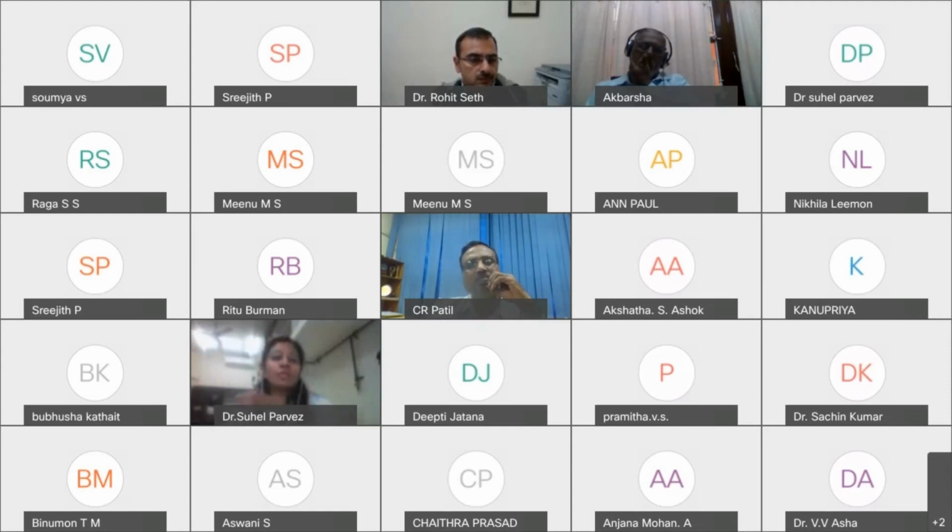We wait for 24 hours to transfer the fly. There are some videos you can watch on YouTube. They use a blue kind of media, just dissolved in water, and the media is ready for the fly transfer. So they have different kinds of techniques, and different labs use different techniques.